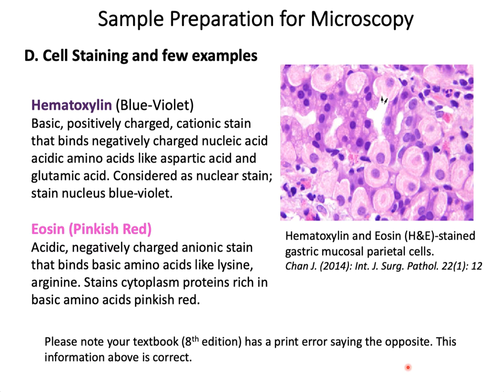There are a number of histological stains, dozens and dozens that are available, all of which enhance the contrast of certain structures within the cells. I want to show you a few that are used commonly. Hematoxylin is very common. It is a nuclear stain and stains the nuclei of the cells a blue-violet color. It is a base and is attracted to acids. So it binds, for example, to the DNA, which is an acidic molecule, and highlights the nuclei in the cell.